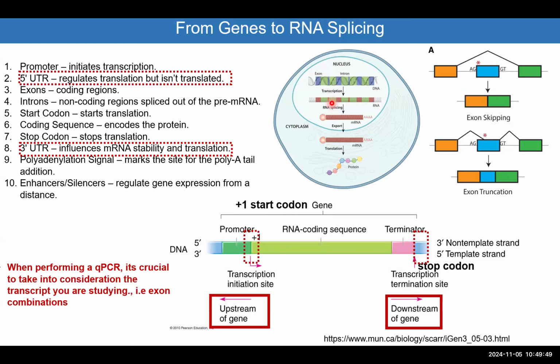While on the spliced messenger RNA, exon 1 and exon 2 will be very close. There will be no spaces, sorry. Then you can amplify that, and then you can detect the messenger RNA.